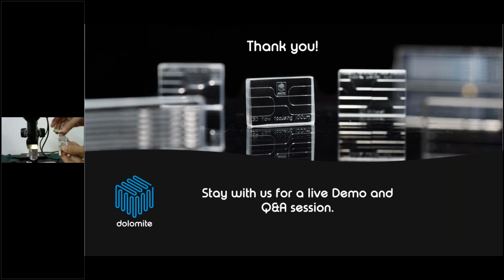You can see in here, the tubing we connect with the linear connector to connect to the chip very quickly, without using any tool.